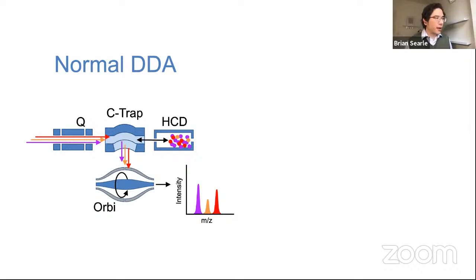If you've got a nice representation of your peptides amongst those million ions, then you can get really good measurements for their precursor scans. But realistically, if there are fewer and fewer of one particular population, you might not have any of those ions actually in that 1 in a million HCD cell.